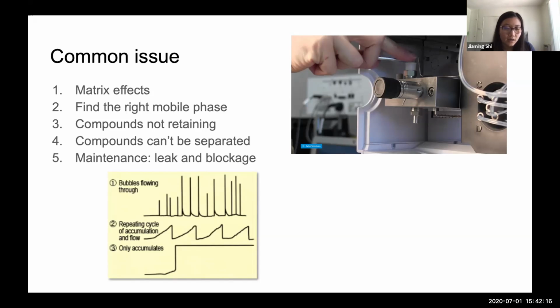So yeah, that's usually the maintenance issue that we come across during using it. The components of HPLC usually are very steady, they don't break very much, but definitely the plumbing is the thing we usually work on when doing maintenance on the system. You just always need to make your loop very clean so everything can go through and there's nothing stuck in there, stuff like that.